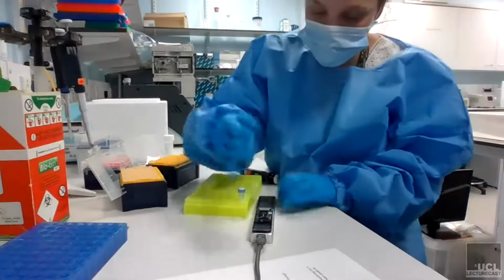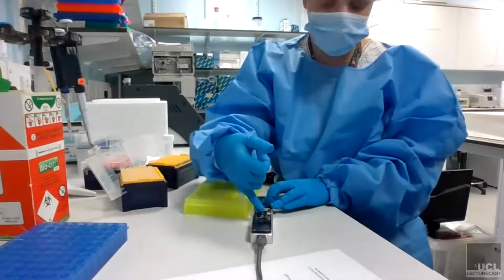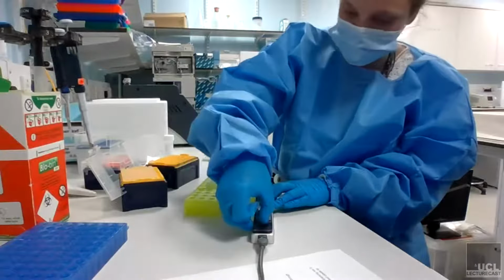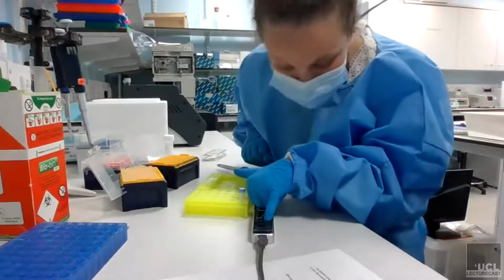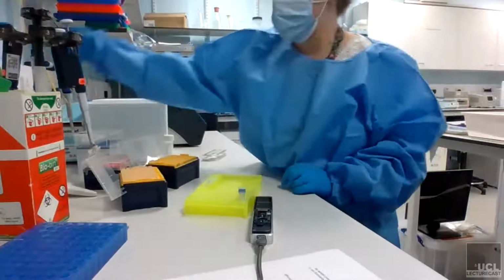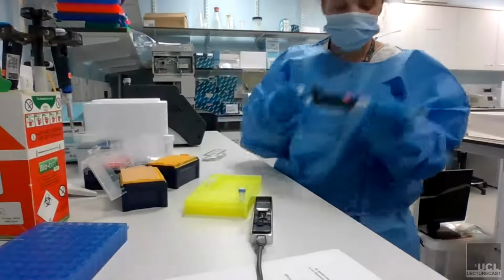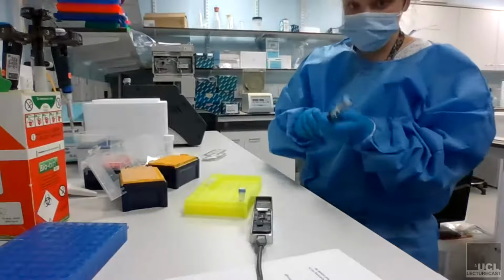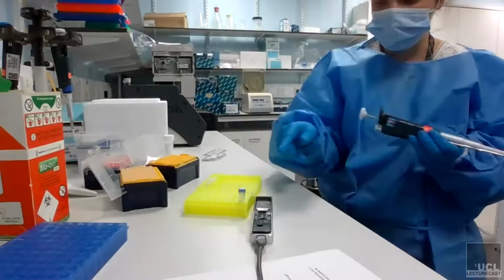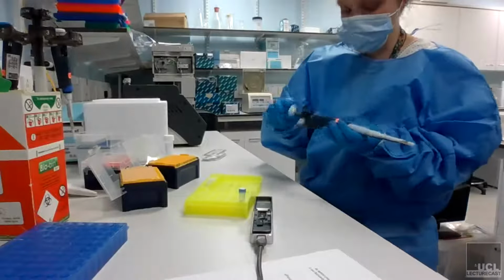So there's two different holes for the flow cell. We've got the spot-on hole, which is where you add the sample, but we've also got this hole which spins around. Ooh, I got my glove stuck. Hopefully you can just about see there's a little hole there. So that is the priming port, and it's specifically designed to fit the tip of a P1000. Now, I showed everybody in the other video and the other meeting how to add the priming buffer without adding bubbles, but I will go through it again quickly, and then you and I can practice in a bit.